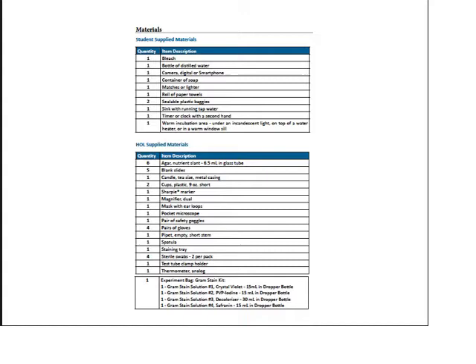From the kit you'll need nutrient slant agar in 6.5 milliliter glass tubes, blank microscope slides, a candle tea-size with metal casing, plastic 9-ounce cups, a Sharpie, a magnifier, a mask with ear loops, a pocket microscope, a pair of safety goggles, a pair of gloves, pipettes (empty short stem), a spatula, a staining tray, sterile swabs (two per pack), a test tube with a clamp holder, and an analog thermometer.